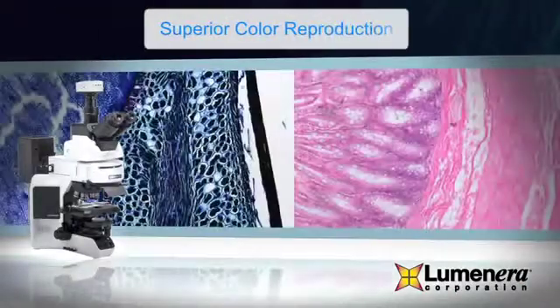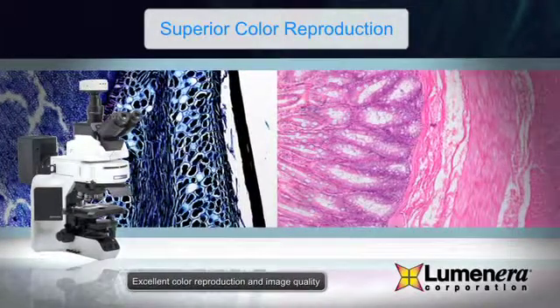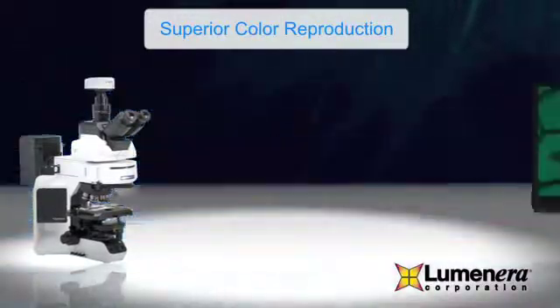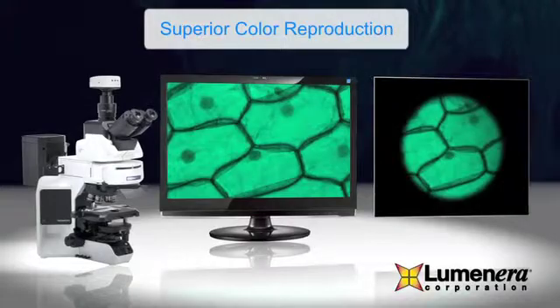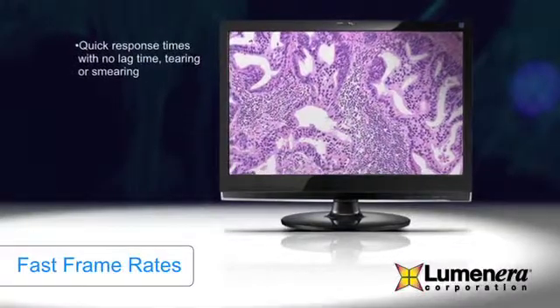Years of experience in the microscopy market have allowed Luminara to develop specialized algorithms ensuring unsurpassed color reproduction. This results in a sample preview on a monitor that closely matches the view on the microscope eyepiece. Fast frame rates provide you with an instantaneous response to focusing or repositioning your sample.